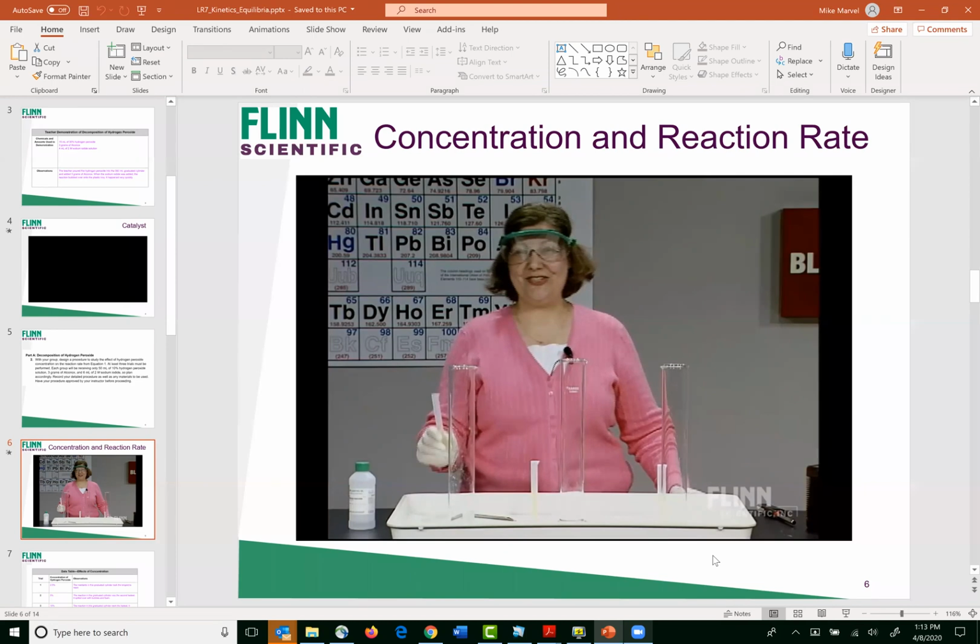No, that's all right. While we're waiting for the question, I'll tell you the question. What's the independent variable in this experiment? What is the independent variable? If we don't get the question to deploy, we can answer it the old-fashioned analog way. So take a second to think to yourself, we're studying the effect of concentration on reaction rate. What's the independent variable in this experiment that you just saw?